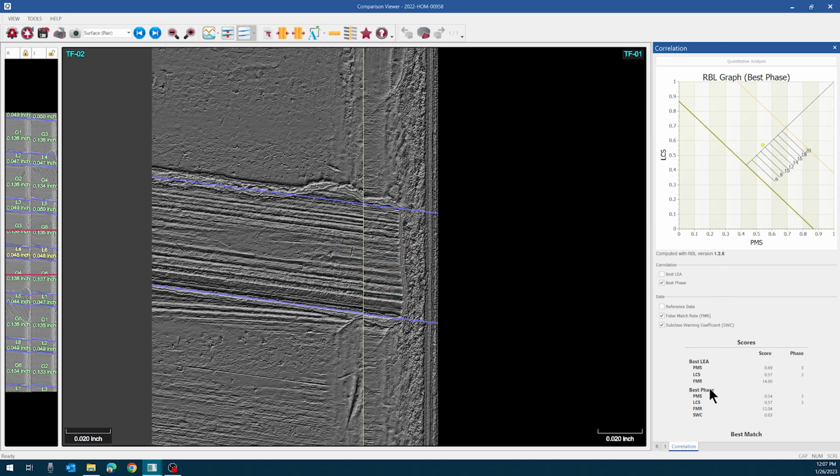So that false match rate value of 12.04 has it charted here just above that 12 marker. So 6, 8, 10, 12, there it is. And there's a mathematical formula you'd use to establish what the false match rate value represents, and that is 1 over 10 to the power of that number value. So the FMR value is 12.04, that's 1 over 10 to the power of 12.04, and in this case that's over 1 trillion. So the odds of a different barrel producing more similar marks to what we're seeing in this comparison here are 1 in a trillion is what that's referring to.